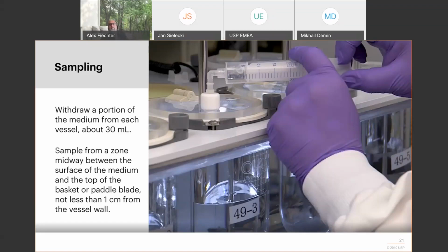Why? If you are attaching a filter directly in line by taking the sample, remember you have undissolved particles in the vessel. You might potentially pull in particles with undissolved prednisone active principle, and through the filter and the turbulation, you will expand the dissolution to it.